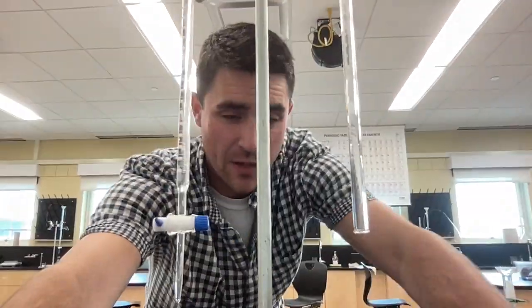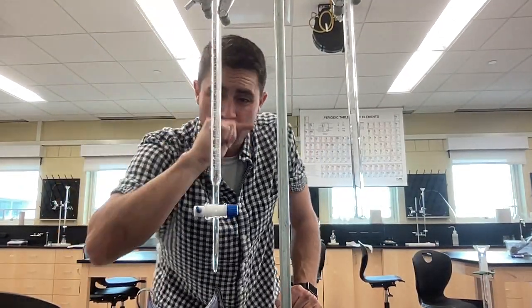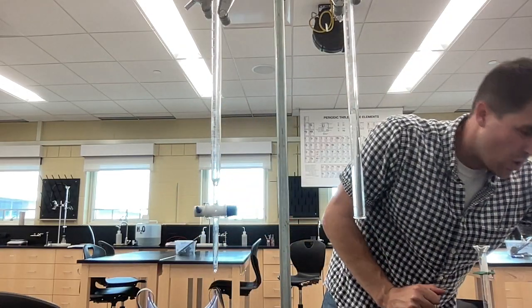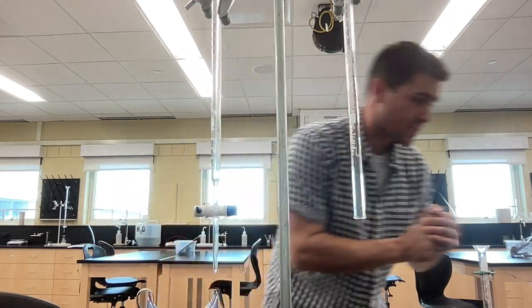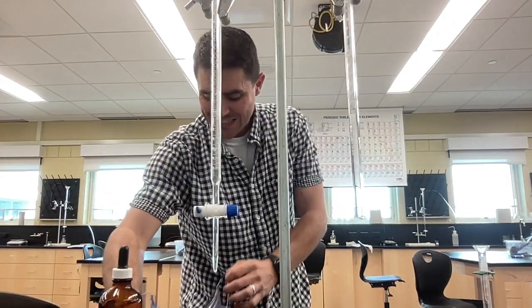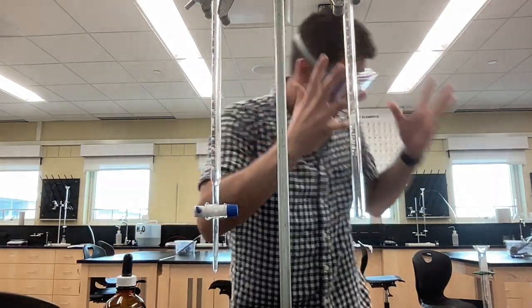Over here, I have got my setup. This is called a burette. A burette is a long column with gradations on it and milliliters all the way down here. I filled this thing up with a base. I have filled this thing up with 0.5 molar sodium hydroxide. What I'm going to do now is take some hydrochloric acid, and this hydrochloric acid has a concentration of 0.5. It's the same concentration as the base in my burette.